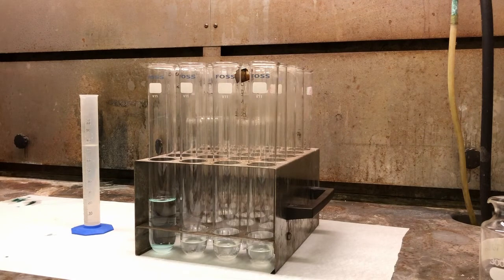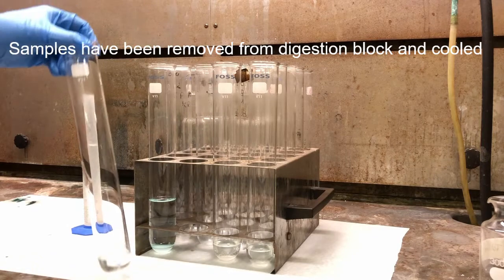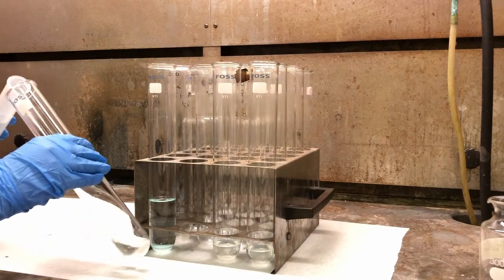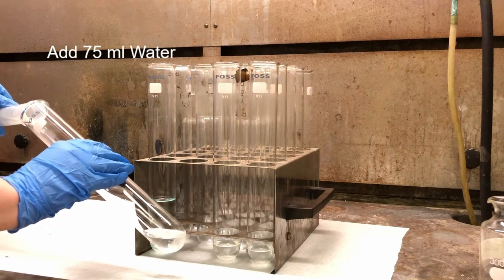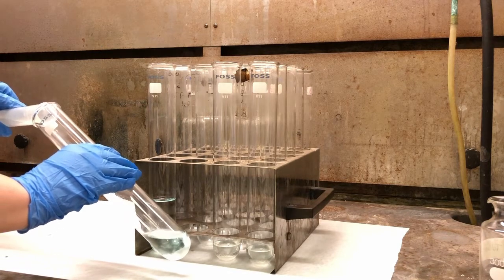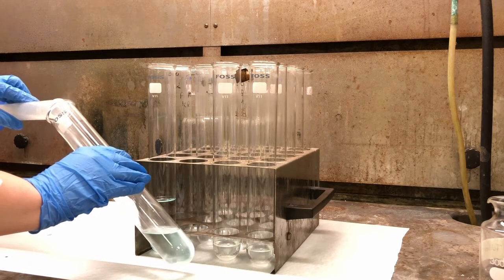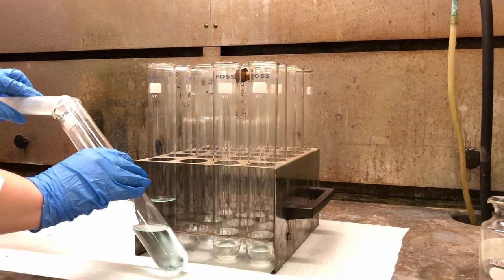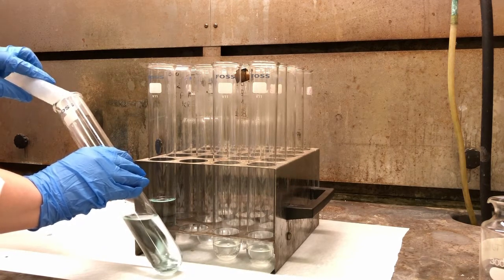So our samples have sufficiently cooled down. They're all digested. So now what we are going to do is add 75 milliliters of water to each one, just to dilute it before we do the distillation. I'm just adding water, and I'm doing it carefully because we're adding water to acid. So we tend to get some vapors given off when we do that, which you can see there. We're still working in the fume hood as well. So we add 75 milliliters of water.